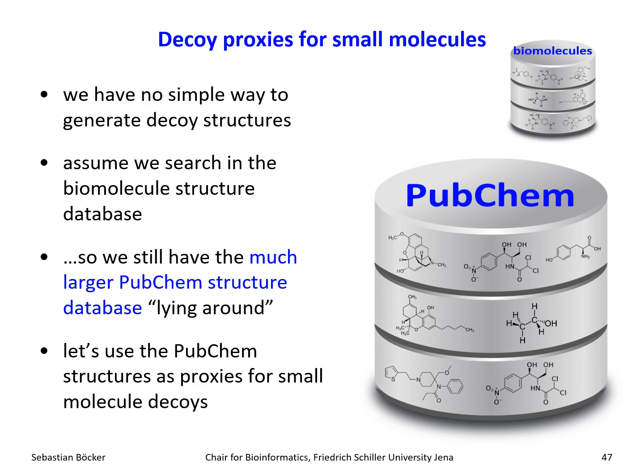And we use a proxy for that. We use all of PubChem as a proxy of small molecules which are out there, but which are not the correct answer. And that's somewhat dangerous because it's possible that actually the PubChem structure is the correct structure and it is inside the sample that you used, and it's not inside your biomolecular structure database because so far nobody knew that this PubChem structure can be found in biomolecules. But as I said, it's a proxy, nothing more. We will see how well it works.